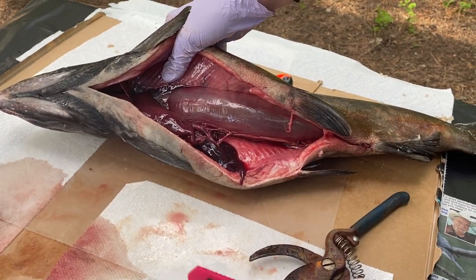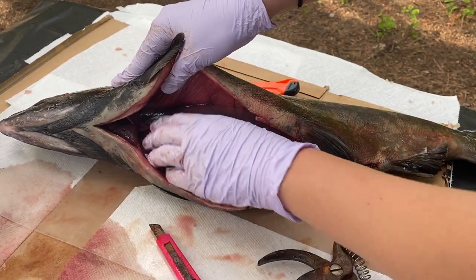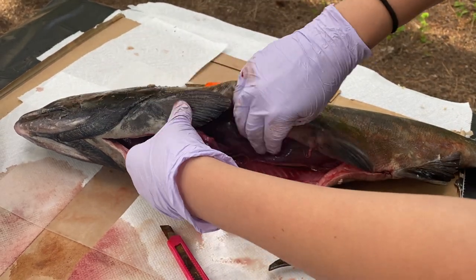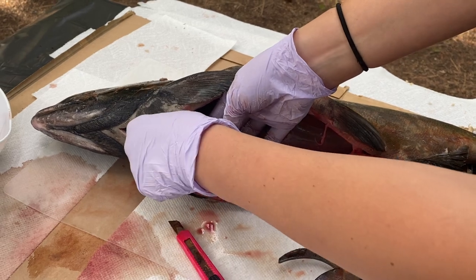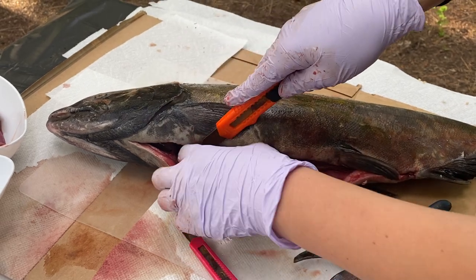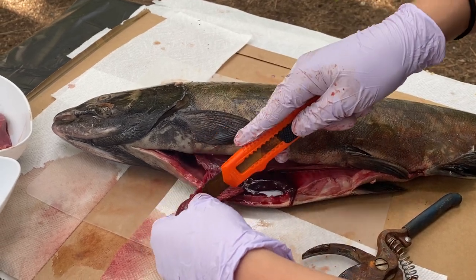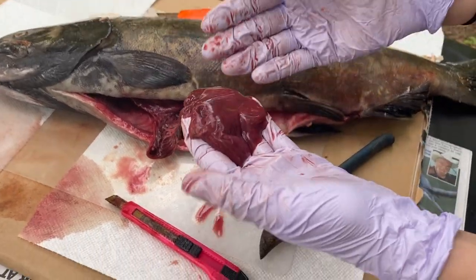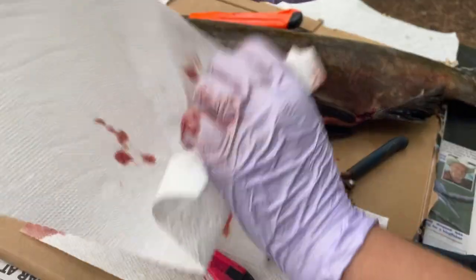So I'm going to take my smaller knife. Maybe before we take it out, we can find the gallbladder. The gallbladder is very tricky. It's this guy right here. Okay. So this is the salmon liver, and if you can see that green little dot right there, that is going to be the salmon's gallbladder.